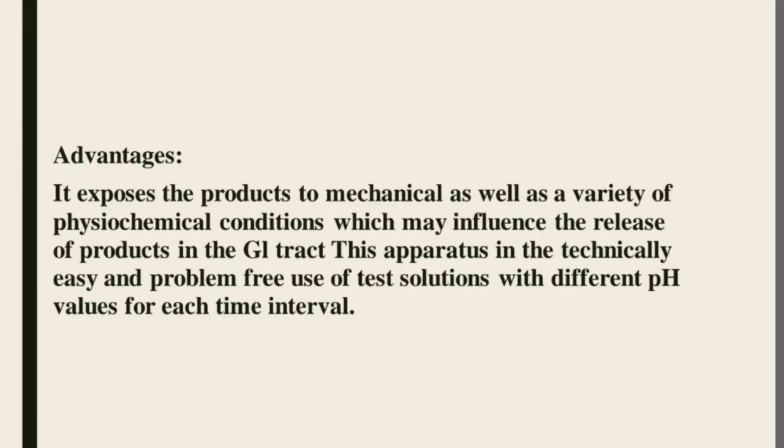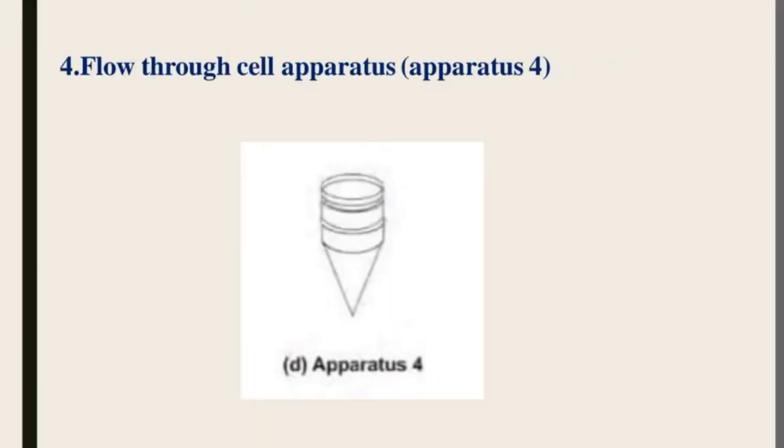Advantages of this apparatus: it exposes the products to mechanical as well as a variety of physiochemical conditions which may influence the release of products in the GI tract. This apparatus is technically easy and allows problem-free use of test solutions with different pH values for each time interval.